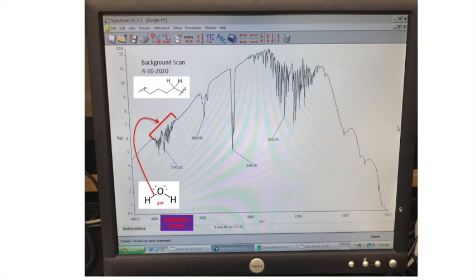And what does it do when it gets hit with that wavelength of infrared? It gets the asymmetric stretch. And I don't remember which is which. I was looking it up and then I had to get going with stuff. So this one is maybe the asymmetric and that's the symmetric stretch. I don't remember which one is which. That's it. All right, now this guy in the middle, you remember what that one is, right?